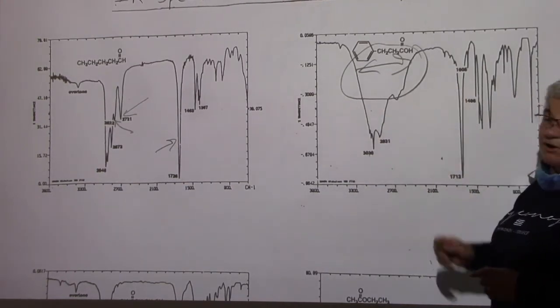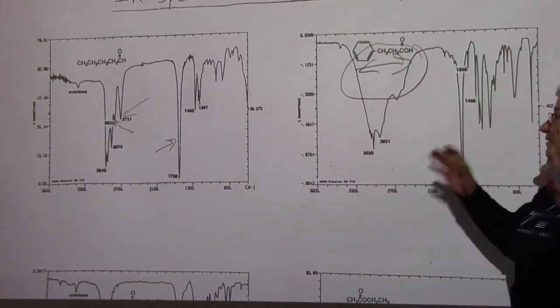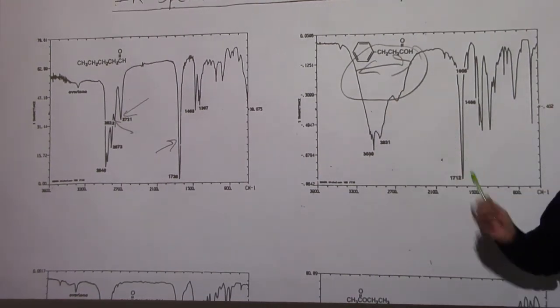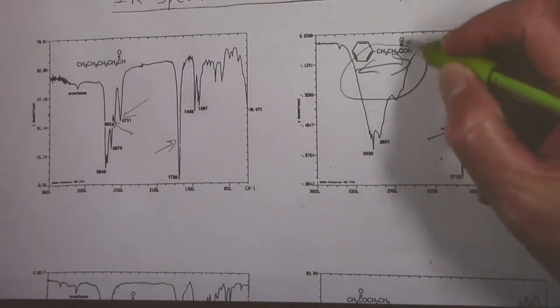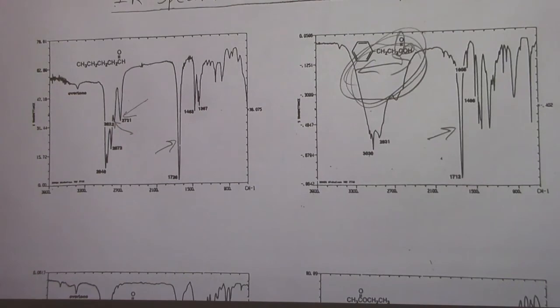When you see a carboxylic acid, it's sort of like seeing an alcohol. Those are easily identifiable peaks. But remember, you need this stretch and this stretch, because this stretch is the CO part of it. This stretch is the carboxylic acid.